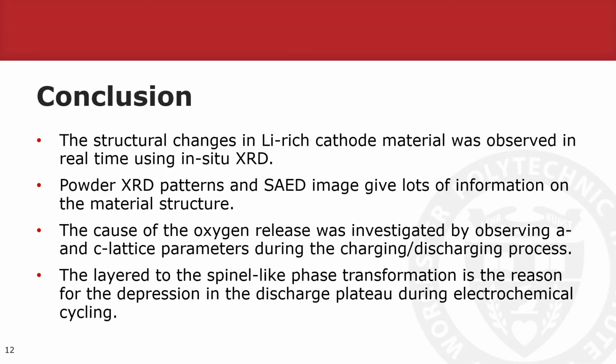This is conclusion. The structural changes in lithium-rich cathode material were observed in real time using in-situ XRD. Powder XRD patterns and SAED imaging give lots of information on the material structure.